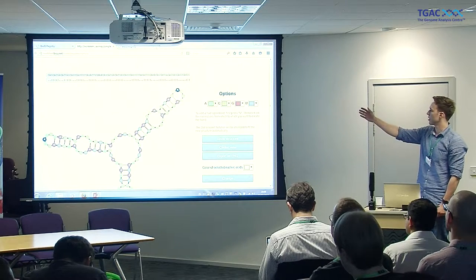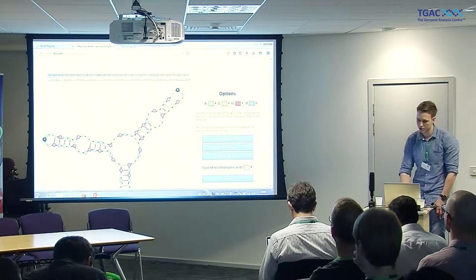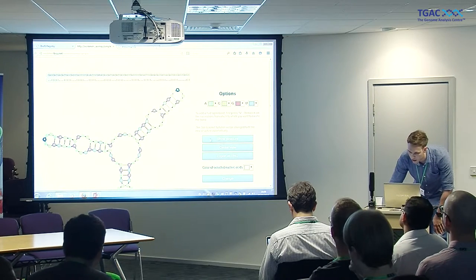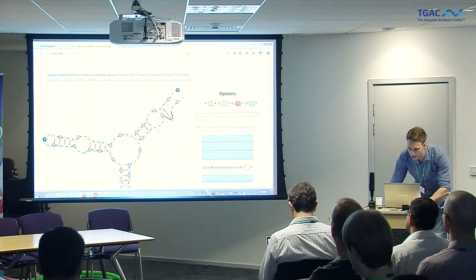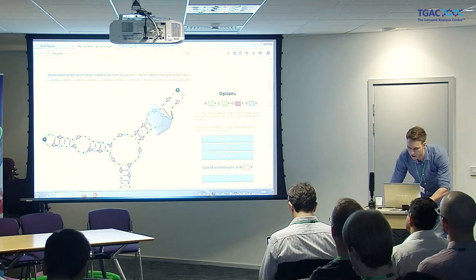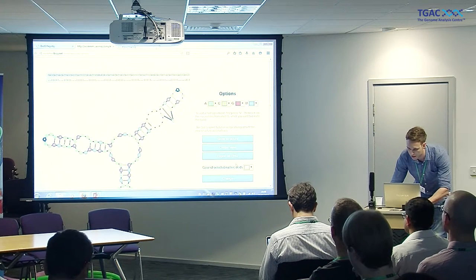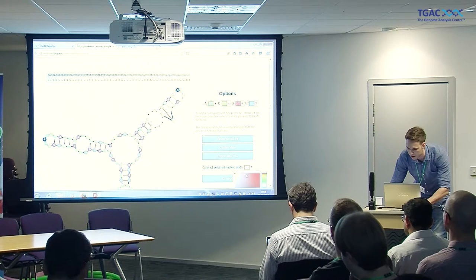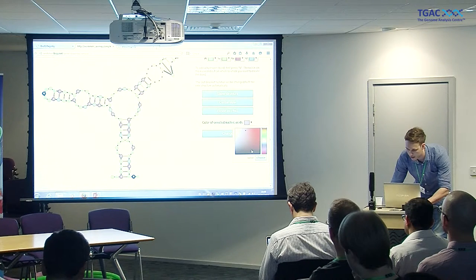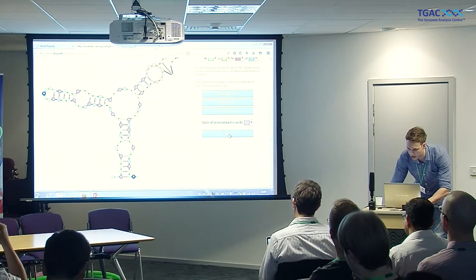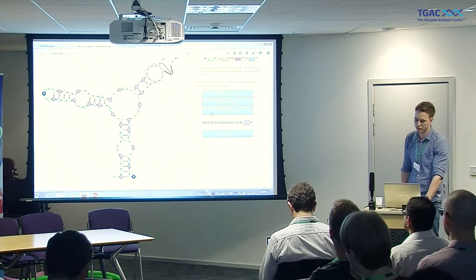Here is a demo of what it looks like. You can put in your secondary structure, then you just click on Show Structure, and the structure gets displayed. You can drag nodes around like this, or you can select nodes — it has a lasso tool for node selection. So you can precisely select nodes, select a color you like, and change it. After you're done, you can export it as a PNG. So that's basically it — it's very simple, but it does what it does.